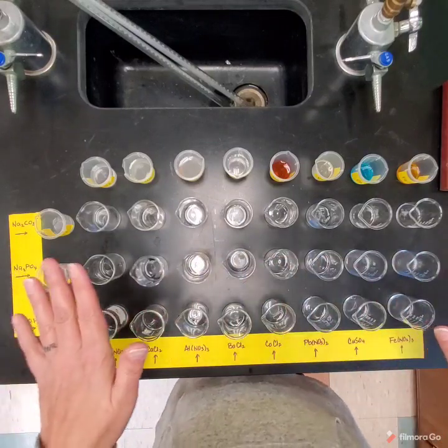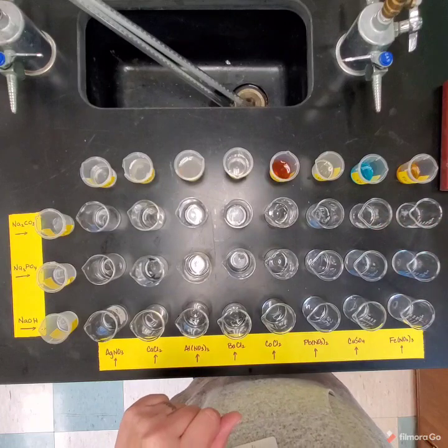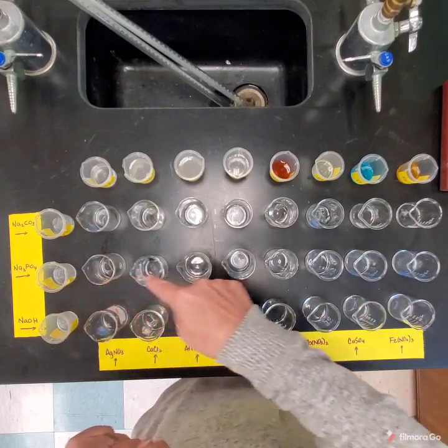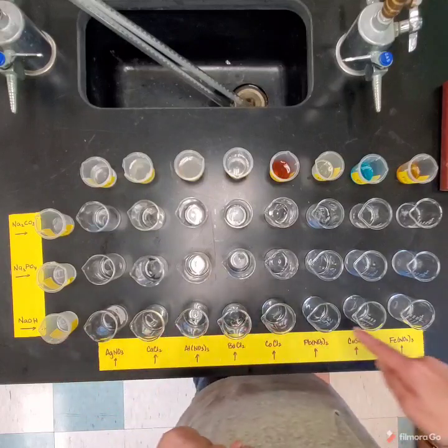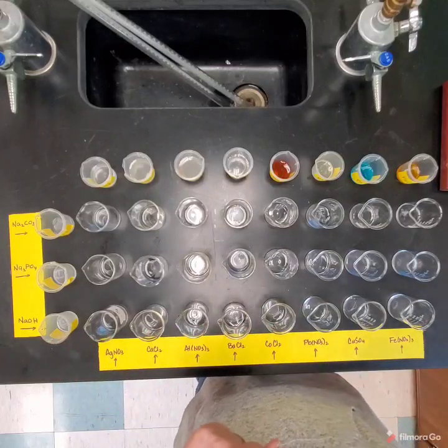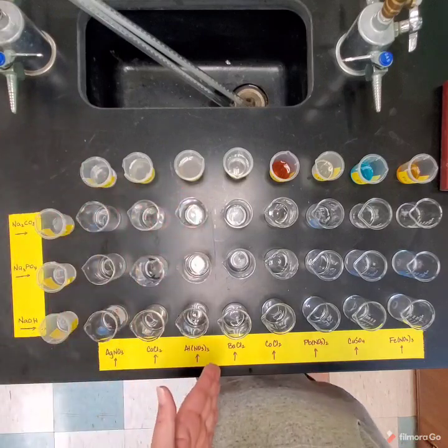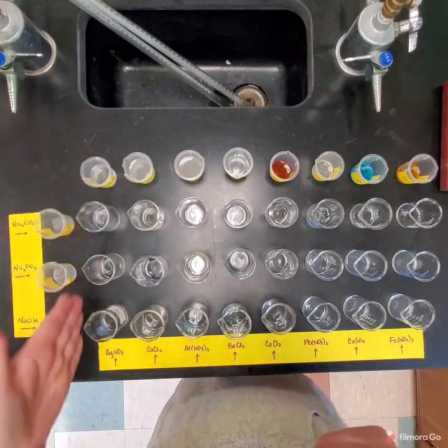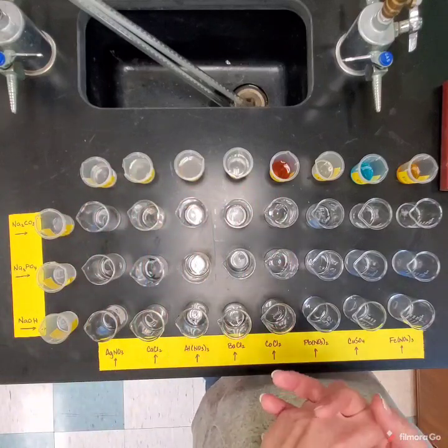So I have 24 beakers set up. This row I have put sodium carbonate in. This row I have put sodium phosphate in. And this row I have put sodium hydroxide in, just a very little bit. Now in your up and down columns, I'm going to put other substances that we're going to mix with it, and we're going to look and see what happens.